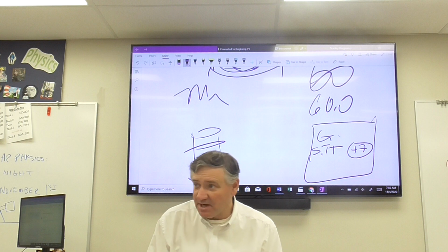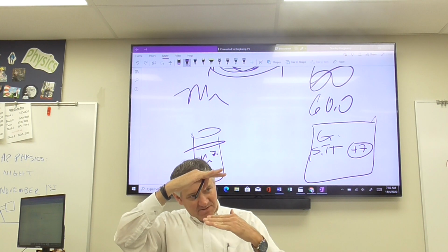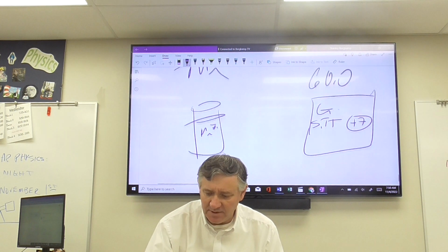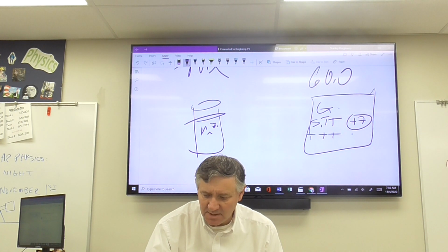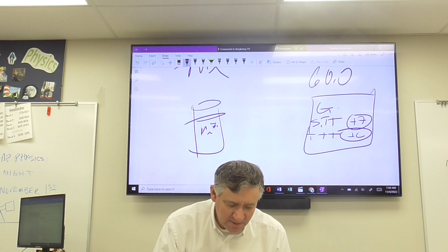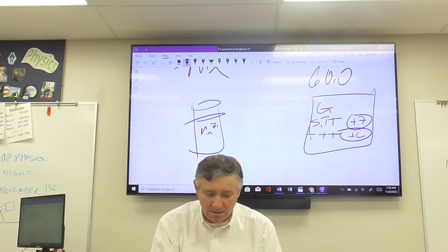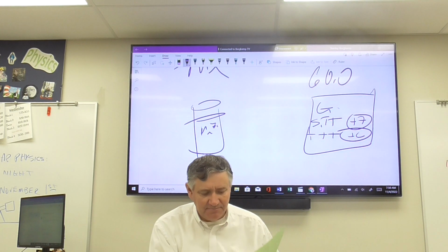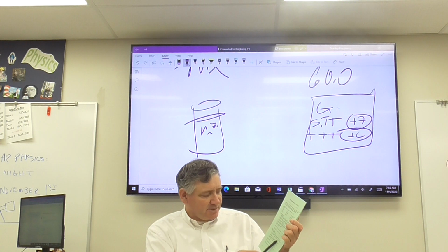Then you can take a tall test tube. Okay, I got tall test tubes over there. They're about like yay. You're going to label that 6+. So then over here, I need a tall test tube, and I'm going to label that 6+. To do that, you're going to take 3 milliliters of your 0.01 molar solution of potassium permanganate and put that into a tall test tube.